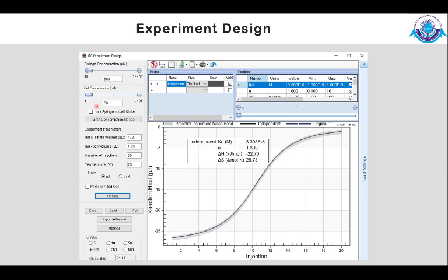With the help of this tool, the optimization would be done seamlessly with one run, because otherwise, without this tool, we have to do a few runs to ensure that we have proper concentrations. Okay, this also helps. So this is pretty much how we can run the experiment and analyze the data, and we'll get the exact parameters.